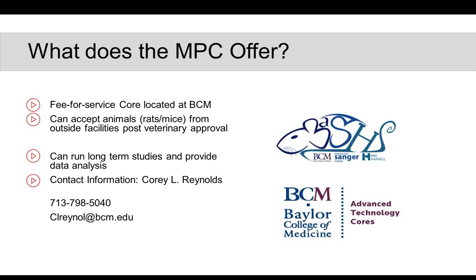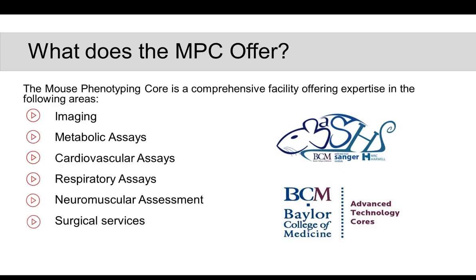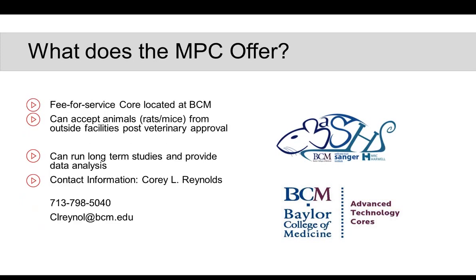All right, again, my name is Corey Reynolds, and I'm the director of the Mouse Phenotyping Core here at Baylor College of Medicine. I want to start out by giving you an overview of what my core is and how we utilize the Mouse Monitor S. So the Mouse Phenotyping Core is a comprehensive facility. We offer expertise in the areas of imaging, metabolic assays, cardiovascular assays, respiratory assays, neuromuscular assessment, as well as various surgical services including transverse aortic banding, myocardial infarctions, telemetry device implantations, and cecal ligations.